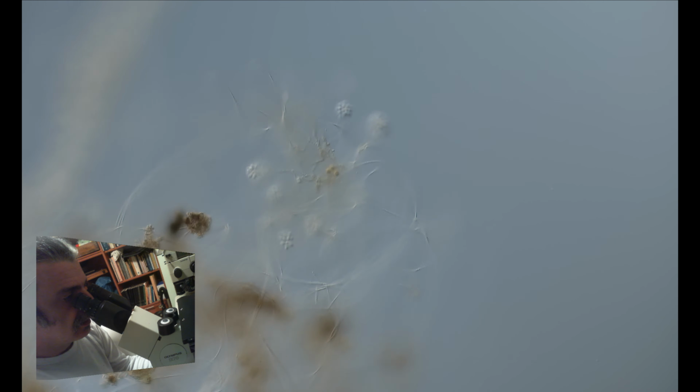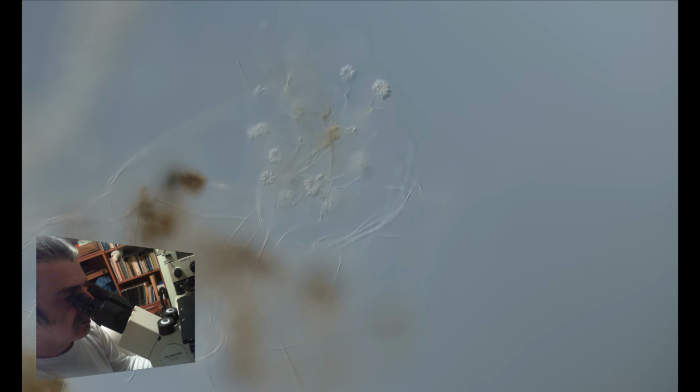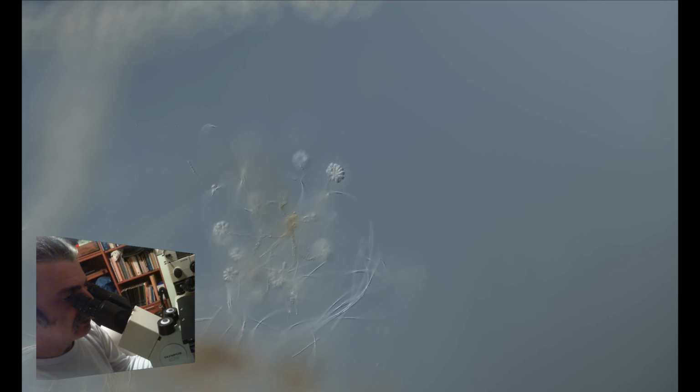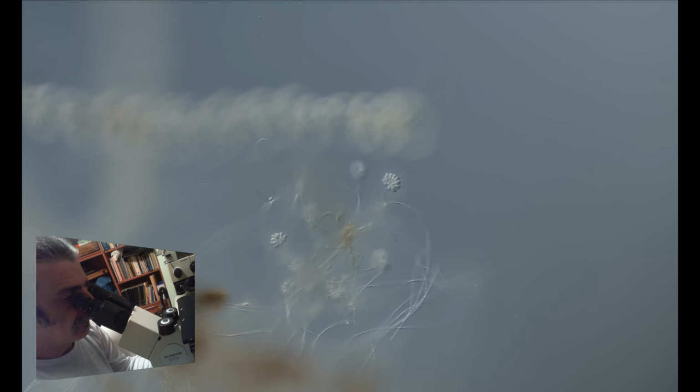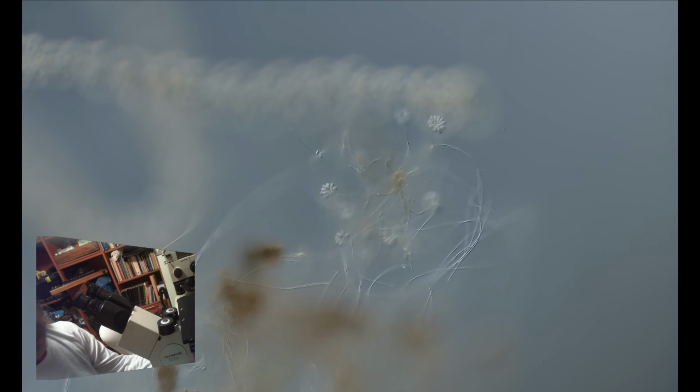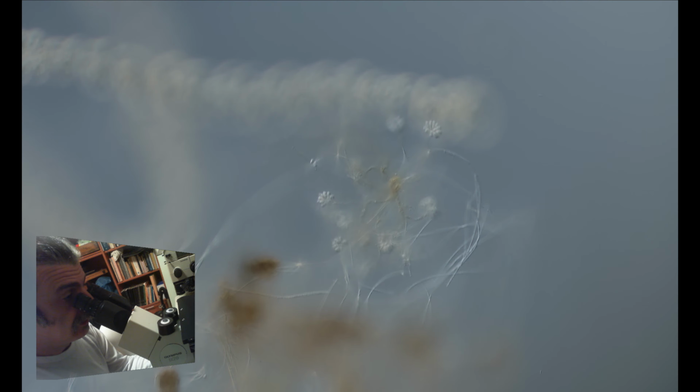in the width of the frame, and we can see here floating on the top of the water communal algae called Synura. Each bouquet contains a lot of single-cell algae that live together in a commune. We'll watch it more closely with the 40x.